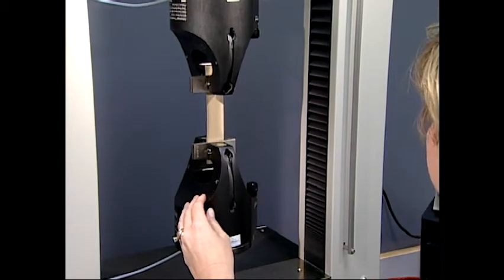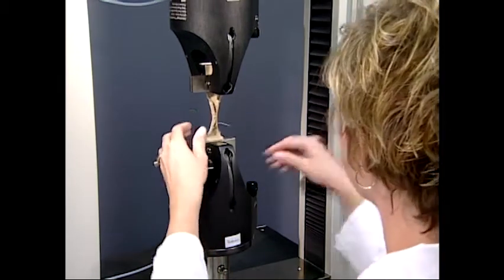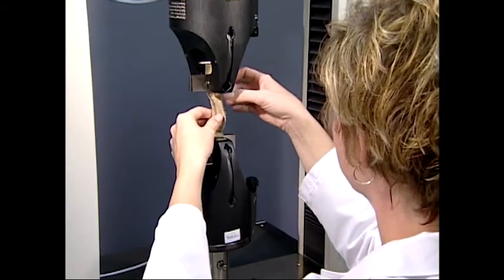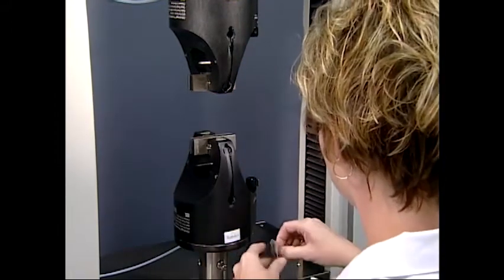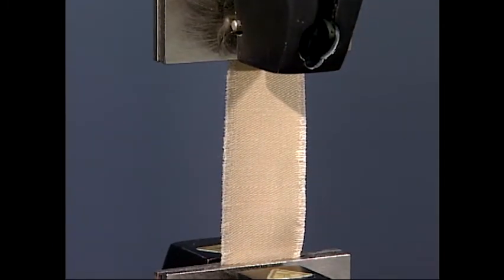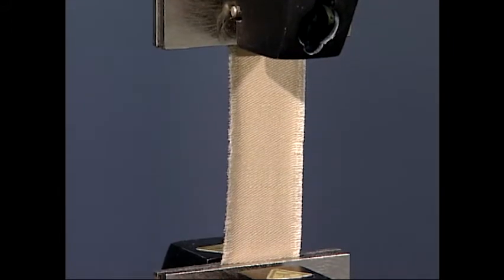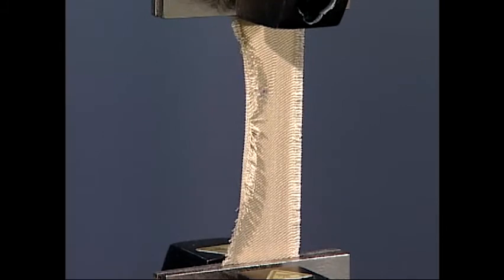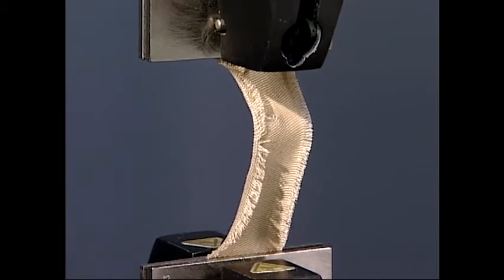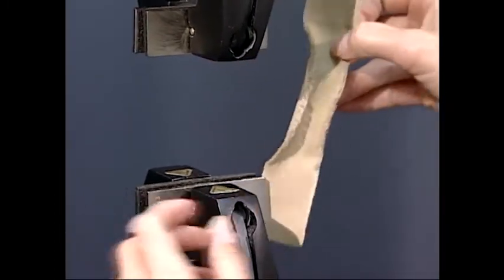These tests are covered under ASTM Test Method D5035, Test Method for Breaking Force and Elongation of Textile Fabrics, Strip Test. In general, the ravel strip method is used for woven fabrics, and the cut strip is used for felted, non-woven, and dipped or coated fabrics. The cut strip method is not recommended for fabrics that have a tendency to ravel under force. Because both of these tests allow only for testing of yarns inside the width of the clamps, the force to break is related to the strength of the yarns.